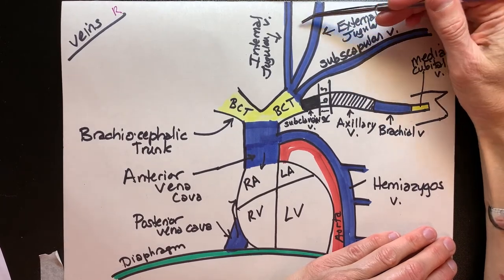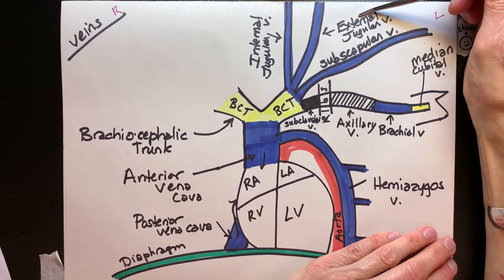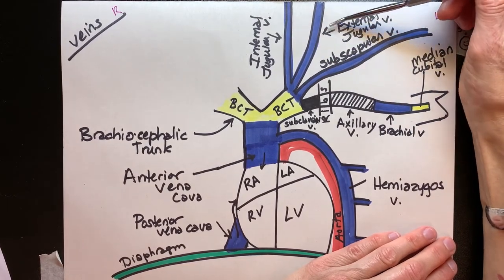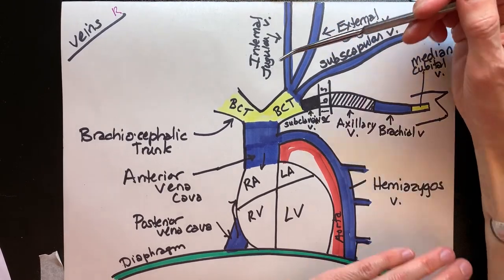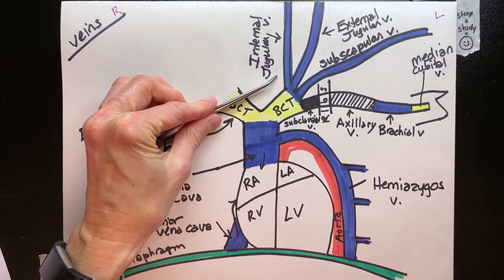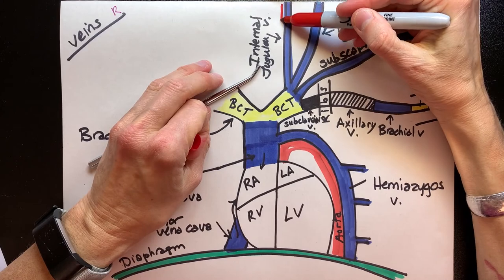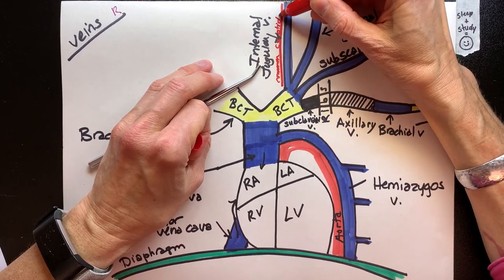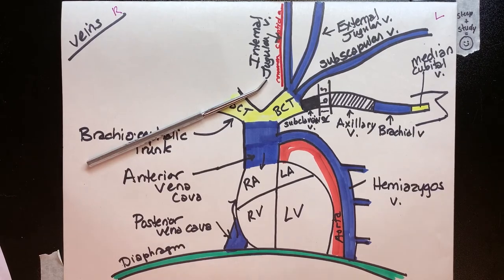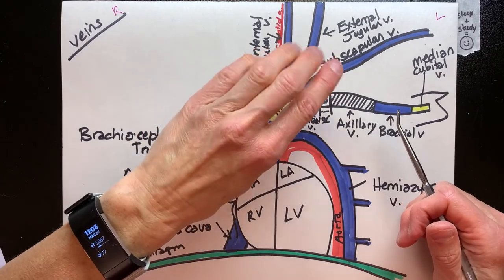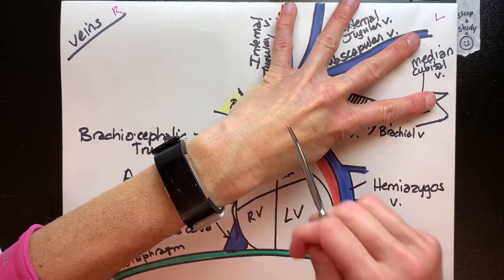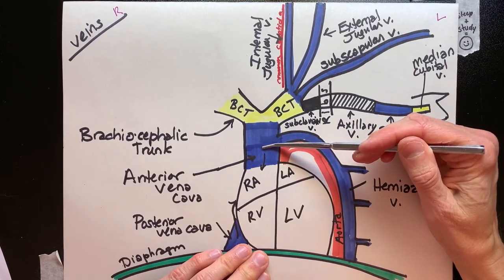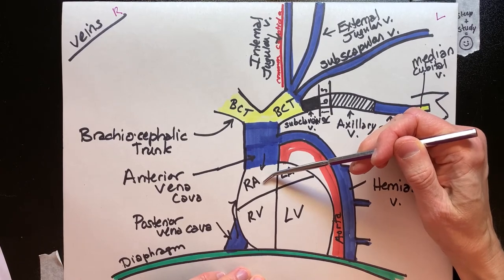The third branch is the external jugular — the most lateral of the two jugulars, and a bit larger than the internal jugular in the fetal pig. Then we have the internal jugular, which runs alongside the common carotid artery. So you'll always note that the internal jugular runs with the common carotid artery. That gives us four branches — one, two, three, four — all coming off the brachiocephalic trunk. Both brachiocephalic trunks then enter the anterior vena cava, and their blood is dumped into the right atrium.